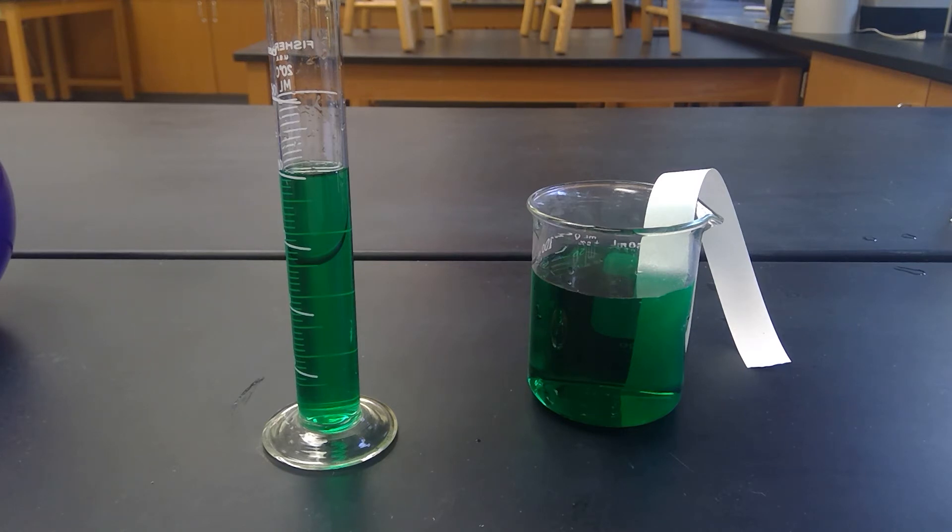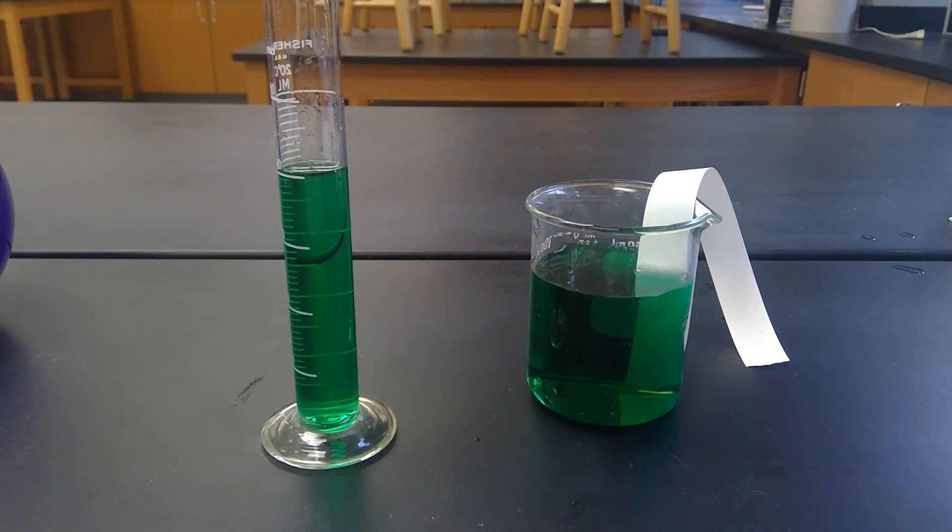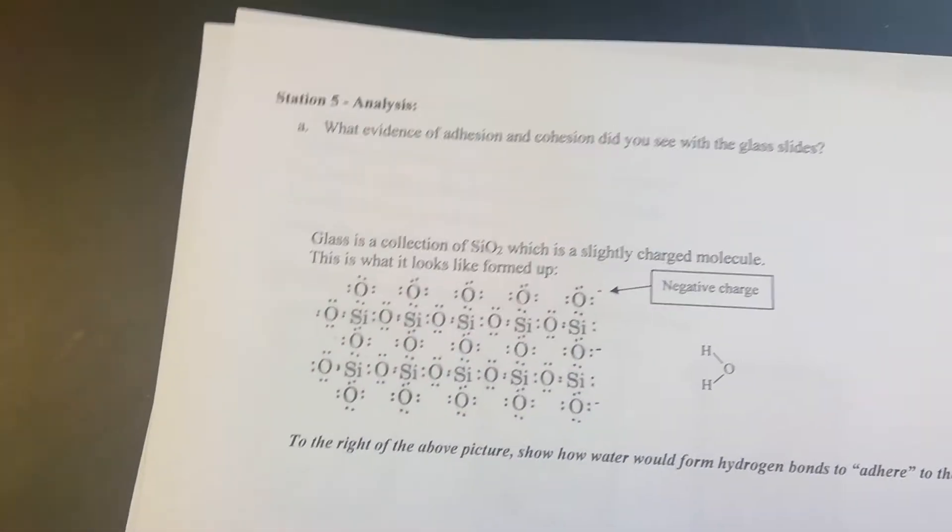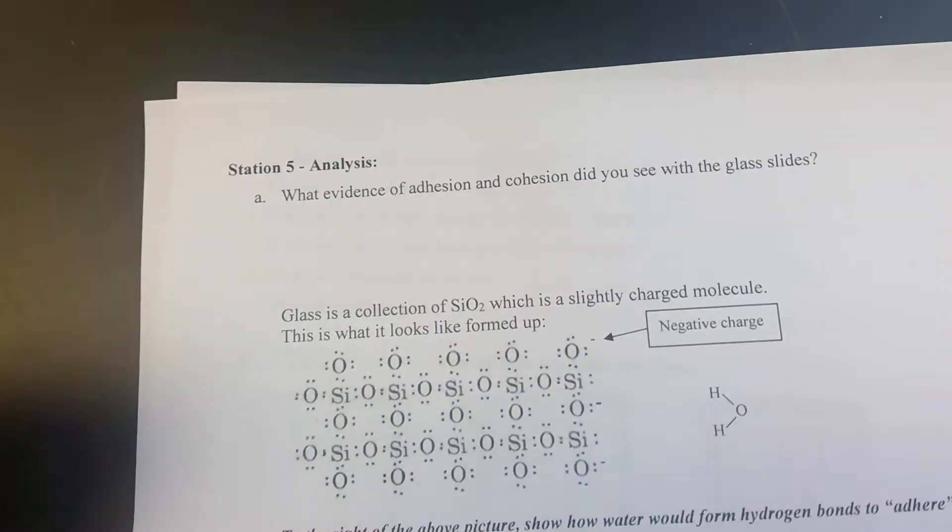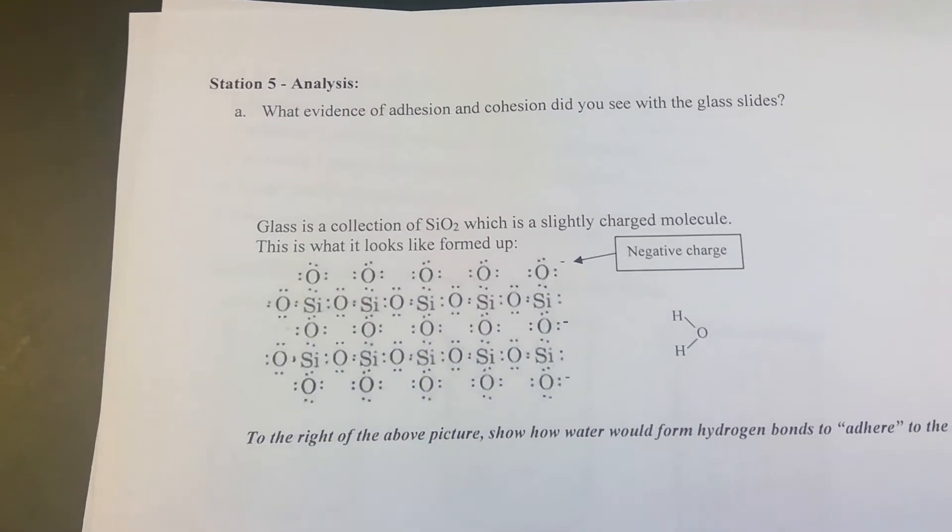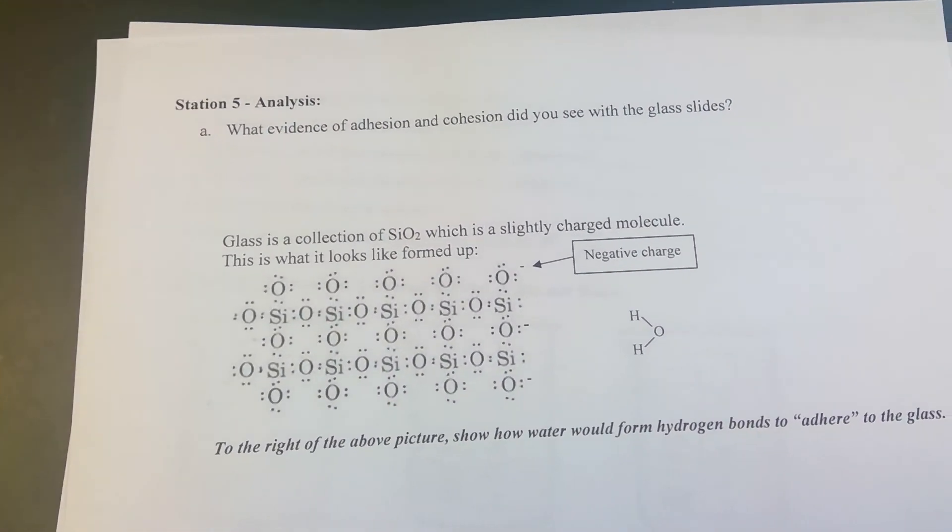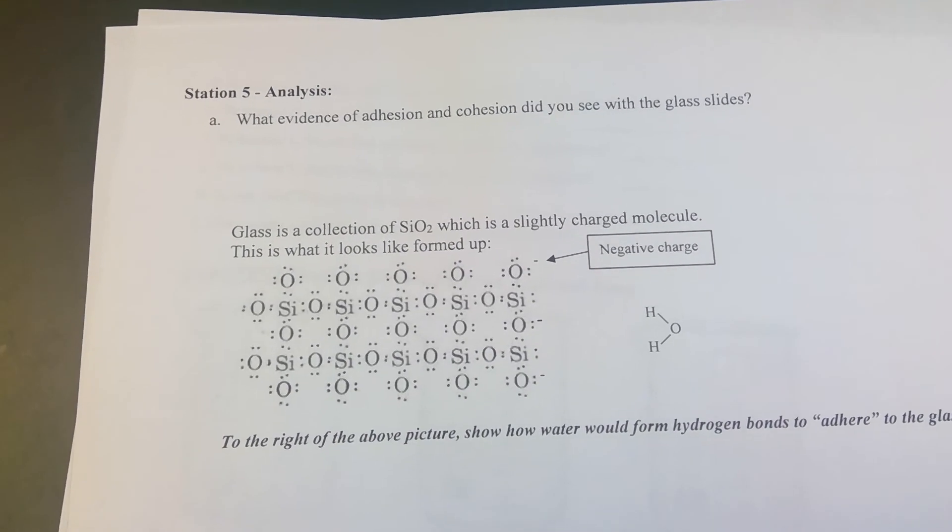You want to look for evidence of adhesion and cohesion on the glass slides. And then you have a picture here. This is a picture of glass, and then this is water. And what you want to show is how a hydrogen bond might form that would lead to adhesion.